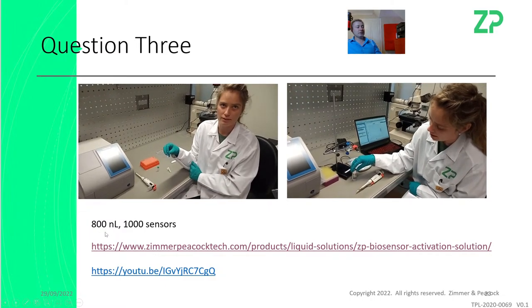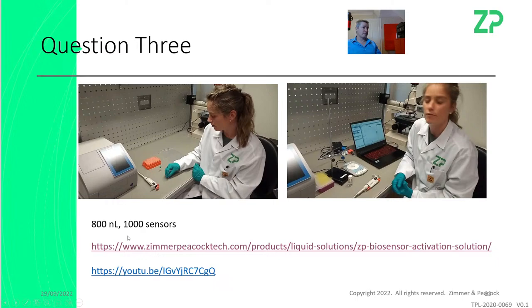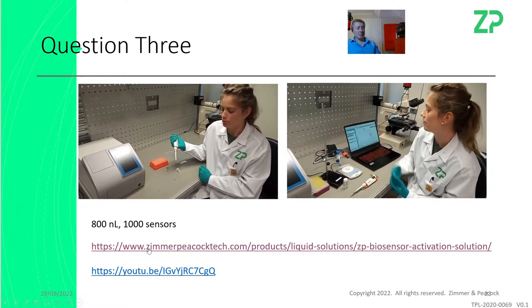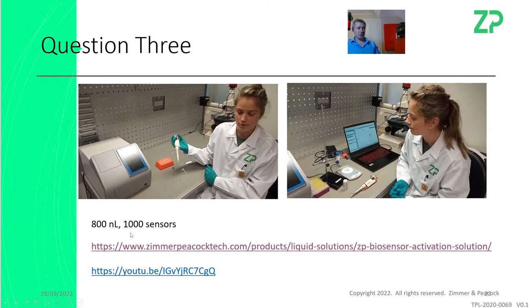She says in the video she uses 800 nanoliters. If that's the case, then you should really be able to make 1,000 sensors, at least, from the 1 mils of solution. So that should keep you busy in the teaching lab for quite some time.